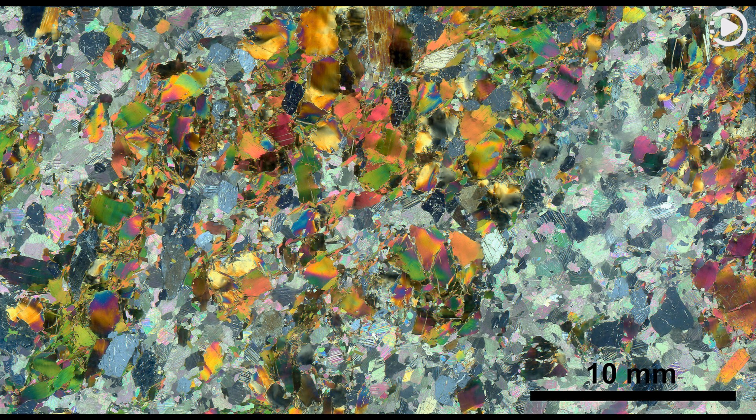This image shows a thin section of Siilinjärvi apatite ore from Finland in cross-polarized transmitted light. The specimen depicted here is approximately 36.6 mm, 1.44 in, wide by 20 mm, 0.79 in, high.